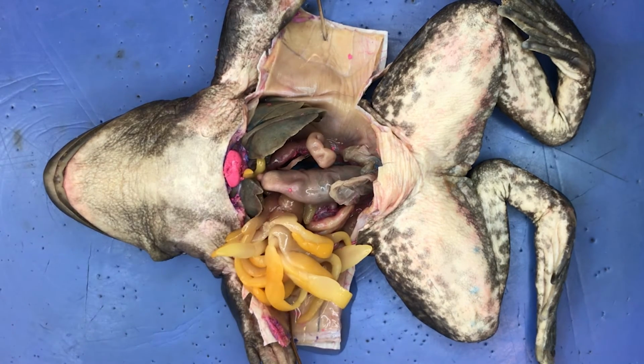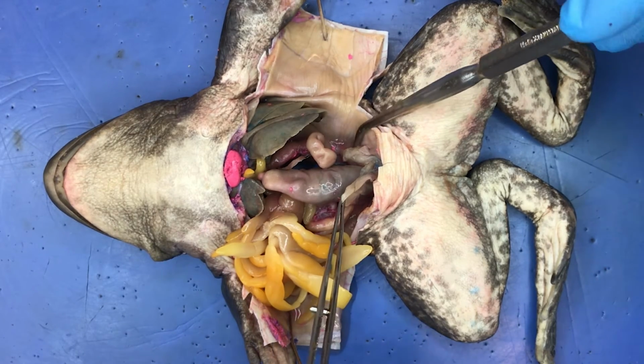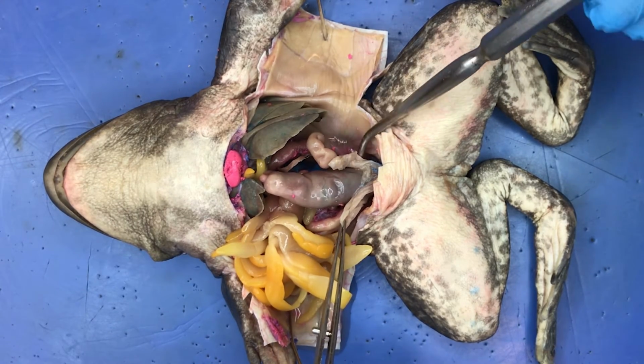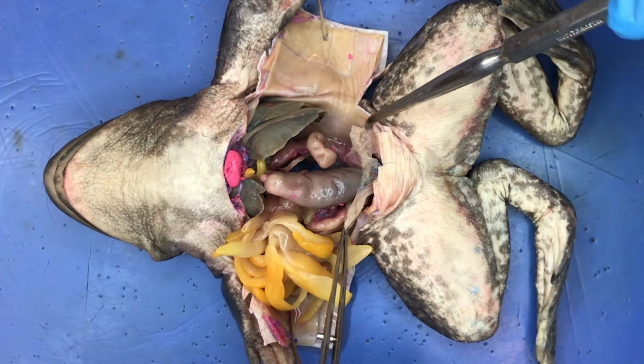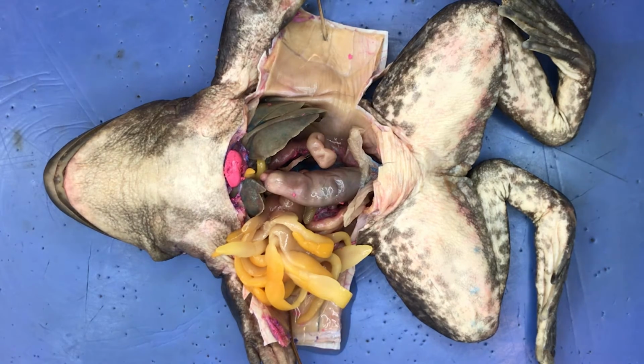In this view, we can also see the bilobed urinary bladder attached to the ventral surface of the cloaca. We will investigate the urinary bladder more in our discussion of the urogenital system.